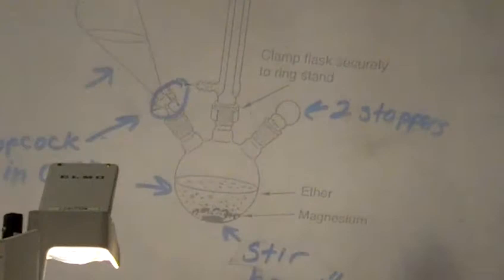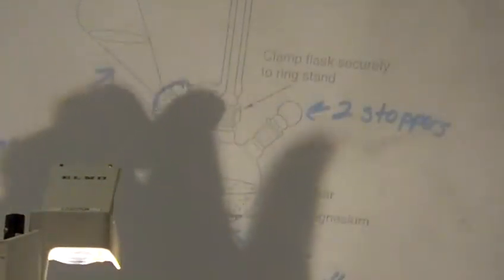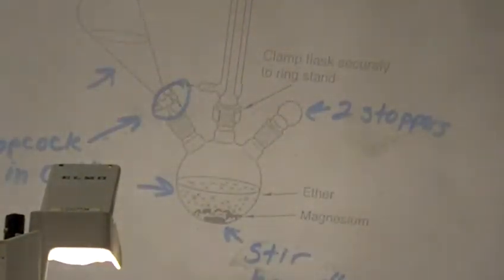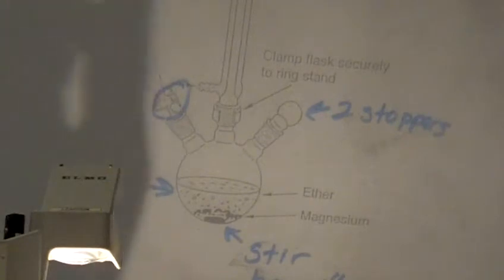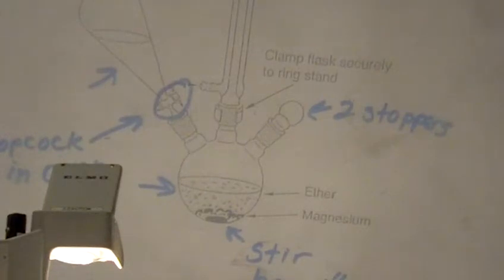Throughout the addition, you want to add it dropwise. What you're doing by adding it dropwise is controlling what's going on in the reaction. We're adding it dropwise so we don't get our alkyl portions to add together, but we also need to control this reaction because it's an exothermic reaction and we don't want it going all at once, okay?